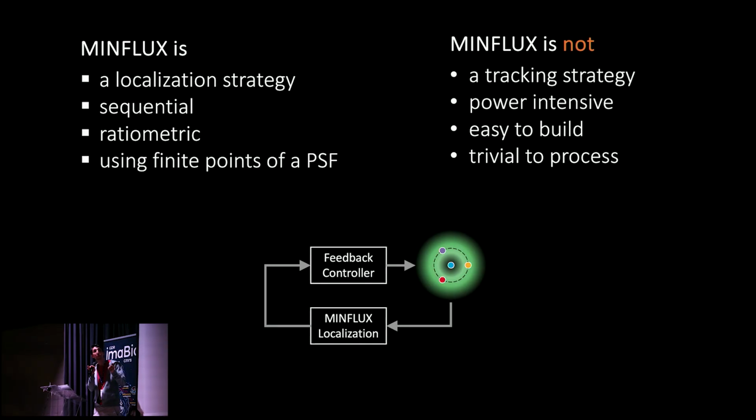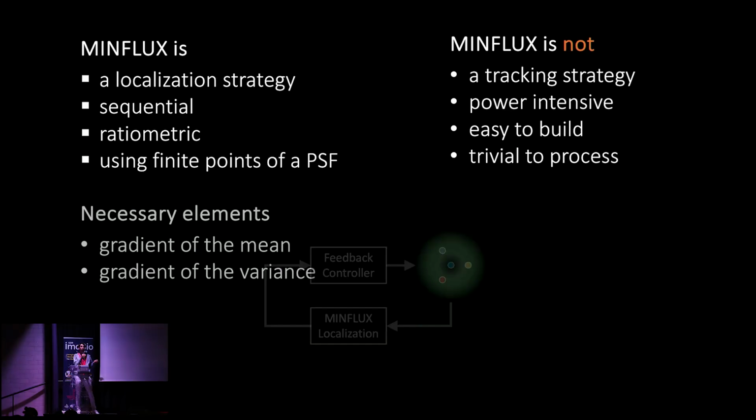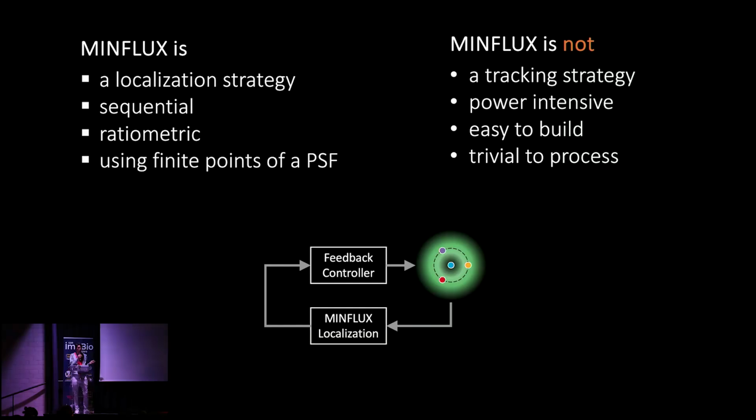And it uses finite points of a PSF in a smart way. MINFLUX is not a tracking strategy because the only job for MINFLUX is to tell you where the molecule is. It's not its job to tell you where you put your beam next. That's the job of a feedback controller. And there's a whole field that studies this problem. So if you have problems tracking, you probably have a not great controller, but it's not a MINFLUX problem per se.